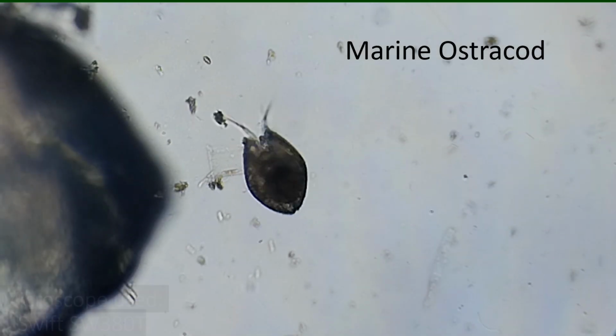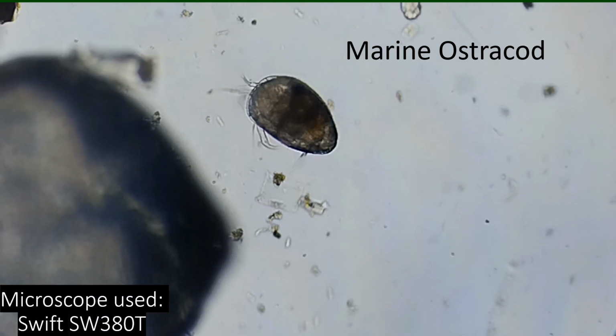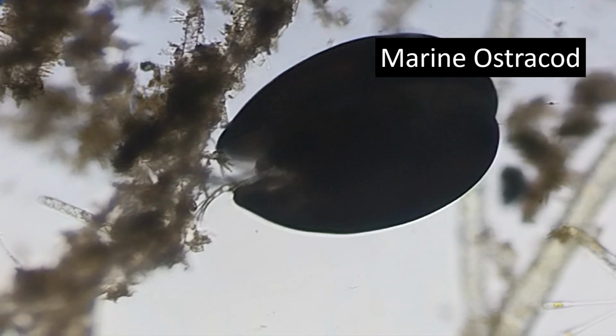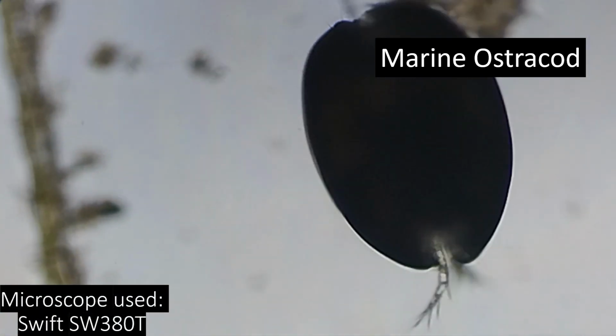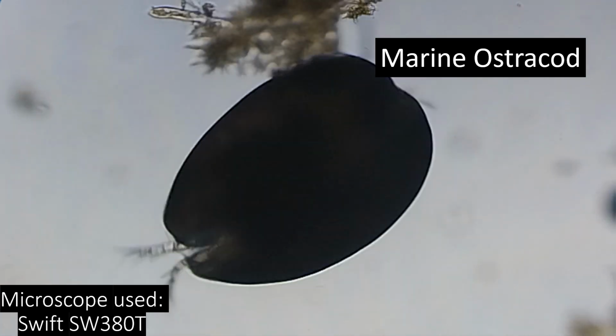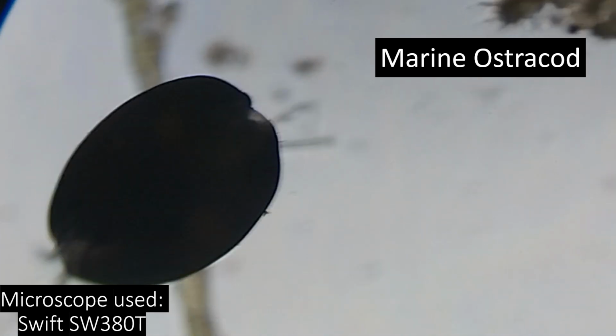I was also able to find this crustacean known as an ostracod. Ostracods are tiny crustaceans which inhabit a wide variety of freshwater and marine habitats. However, I have not been able to film any ostracod using the SW380T microscope before.